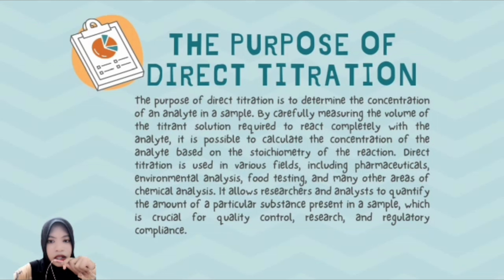Direct titration is used in various fields, including pharmaceuticals, environmental analysis, food testing, and many other areas of chemical analysis. It allows researchers and analysts to quantify the amount of a particular substance present in a sample, which is crucial for quality control, research, and regulatory compliance.